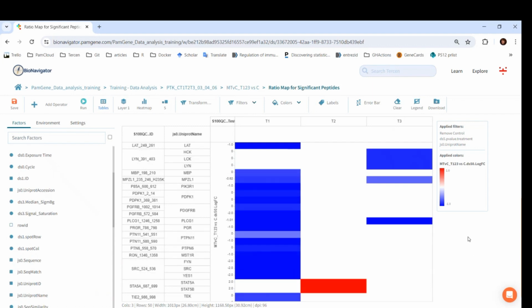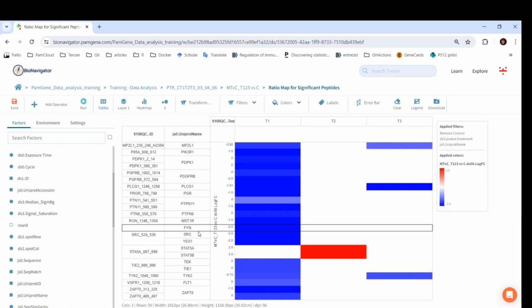However, we do not measure the phosphorylation of native proteins in your sample, but the phosphorylation of only the peptides on the chip. So treat these results as a possibility of protein phosphorylation rather than evidence.